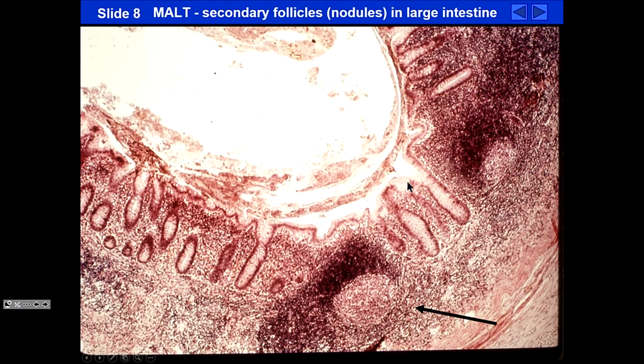Okay, so sometimes the loose lymphatic tissue can aggregate. So here's the loose here. Lymphocytes can aggregate as a nodule. It's a nodule or follicle. It does not have an encapsulating connective tissue around it. And of course this would be a secondary nodule because we can recognize a mantle and the lightest staining central area. This would have more plasma cells producing antibodies as opposed to the mantle, which would be the still unactivated lymphocytes. Questions?